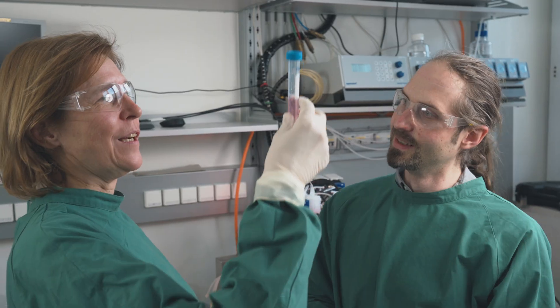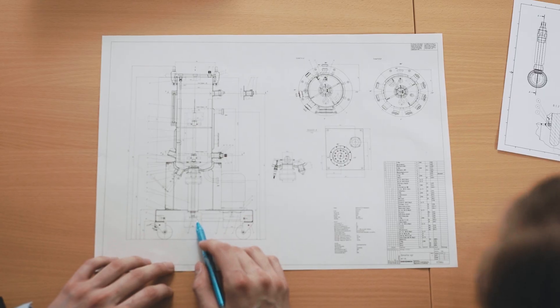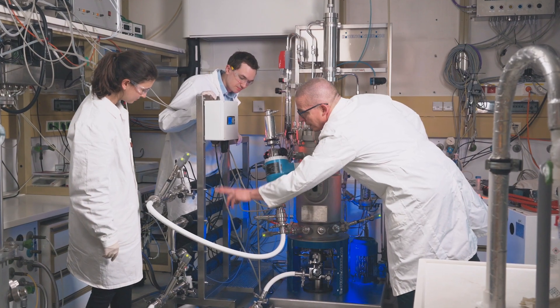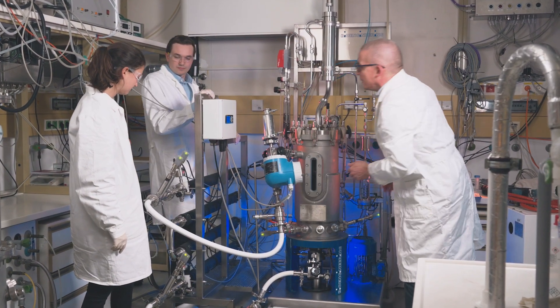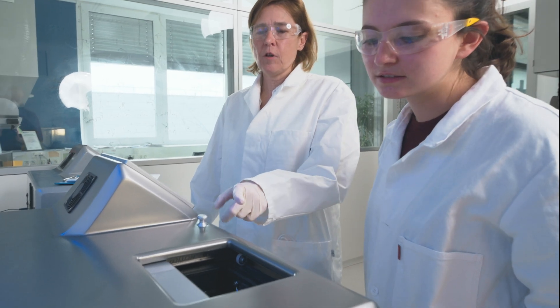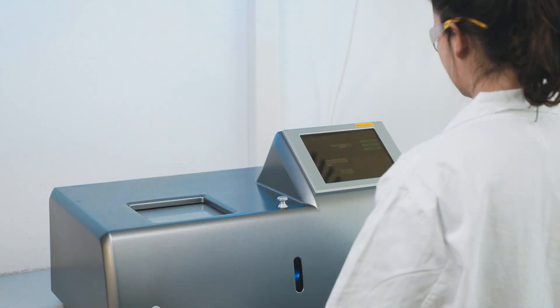We focus on upstream process development and design for biopharmaceutical, industrial, and environmental applications. Our goal is to extract every possible detail to maximize efficiency. That's why we've designed a workflow where we start to screen the cells in the process in miniaturized high-throughput reactors.